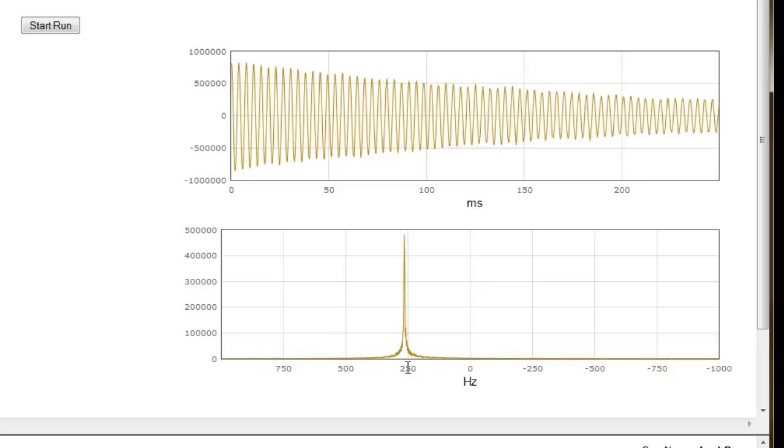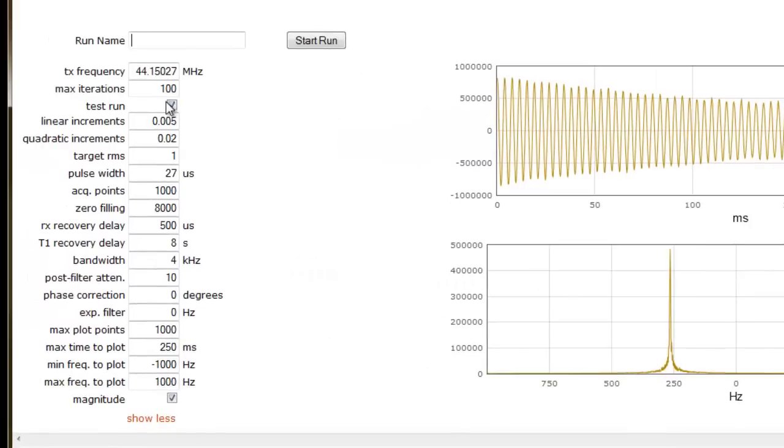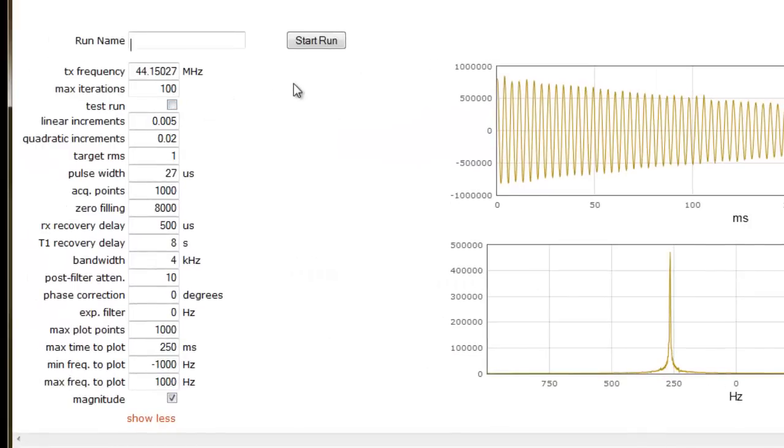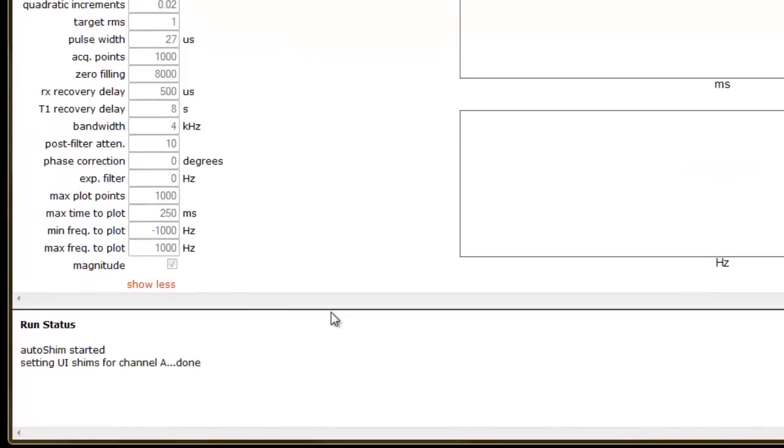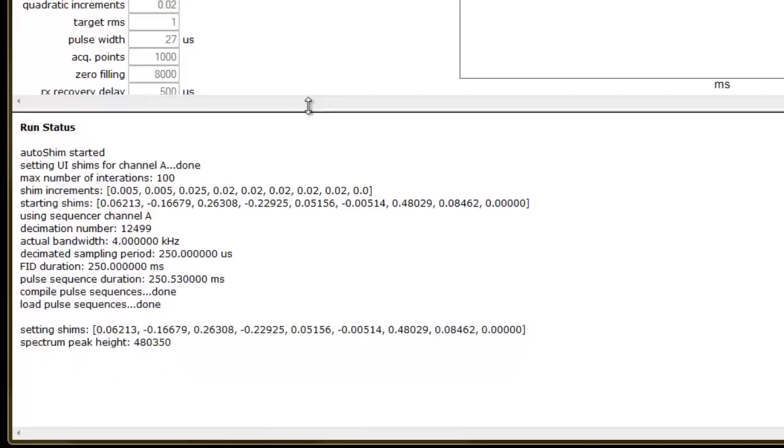Now let's shim our instrument. I'll uncheck the Test Run box, navigate to the Start Run button, and click it. While our instrument is shimming, let's examine the information scrolling by in the text window at the bottom.